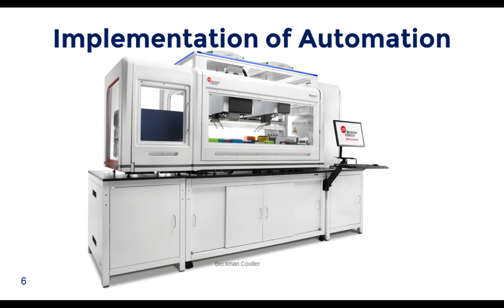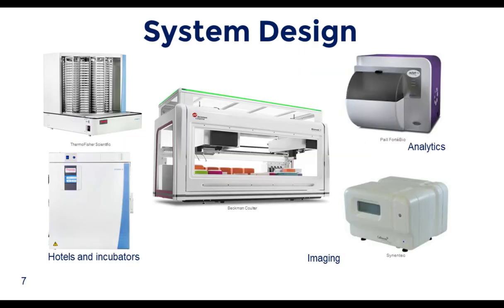One way to address the challenge of decreasing resources while handling increased throughput of greater numbers of clones is automation. Process steps like incubation, plate imaging, and clone evaluation can be integrated to the liquid handling steps of scale-up, providing the ability to process more clones with less resources.